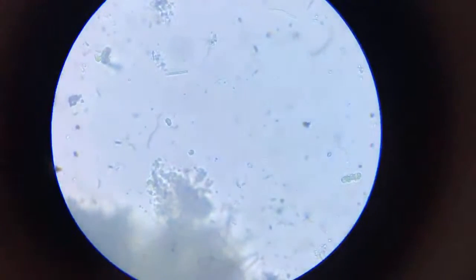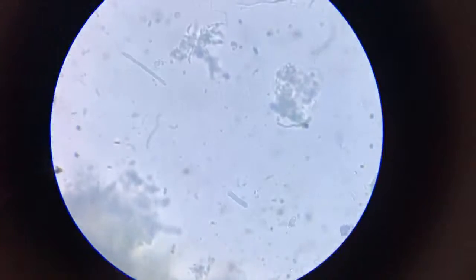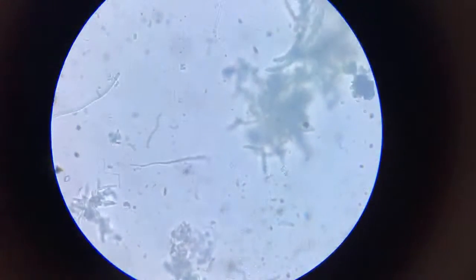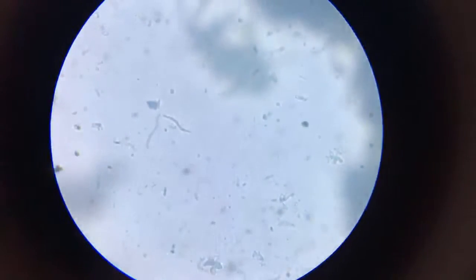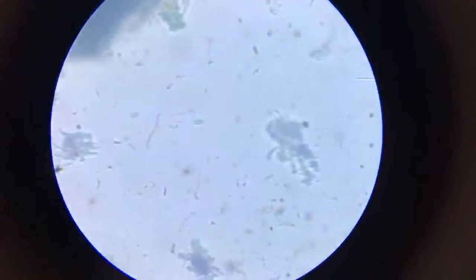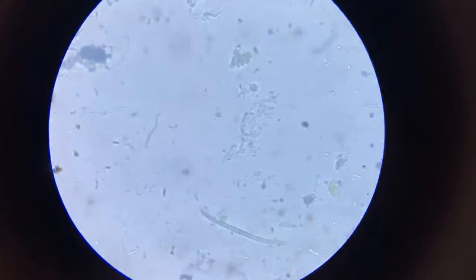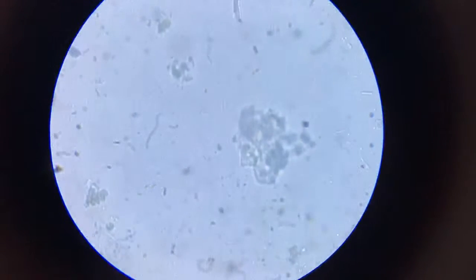Don't find anything more. There was a Vorticella. I just want to bring that in focus so as to give you a perspective of scales, how large these worms are. Unfortunately, I'm not finding any other organism to scale with the worms that we have seen.